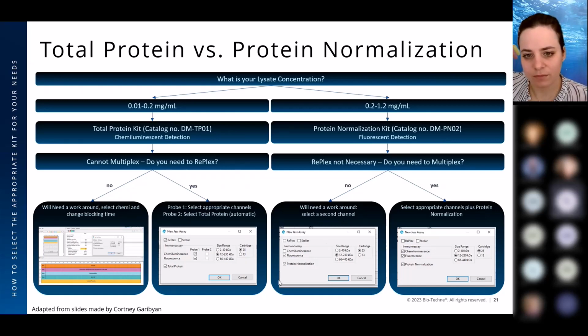If that peak was repeated in the same lysate sample on different targets, we would expect that maybe there is abundance of proteins of that particular weight, right? But it changes between each run. Okay. I mean, that's a fair question. So like Monica said, we would have to review that data. What state or institution are you at?